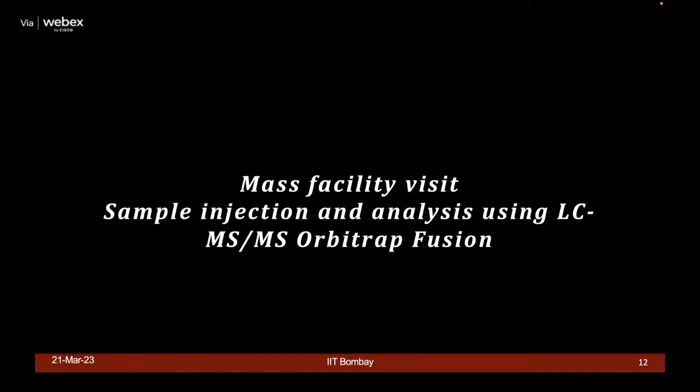Let me now request TS to give you the tour of the mass spectrometry facility at IIT Bombay, where first Dr. Arghya Banerjee is going to show you the Orbitrap Fusion mass spectrometer. All right, so Arghya, over to you.